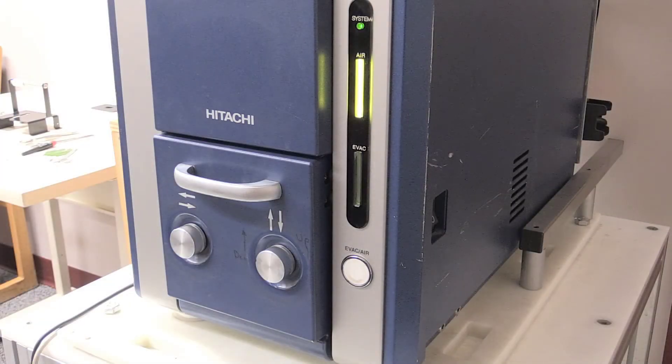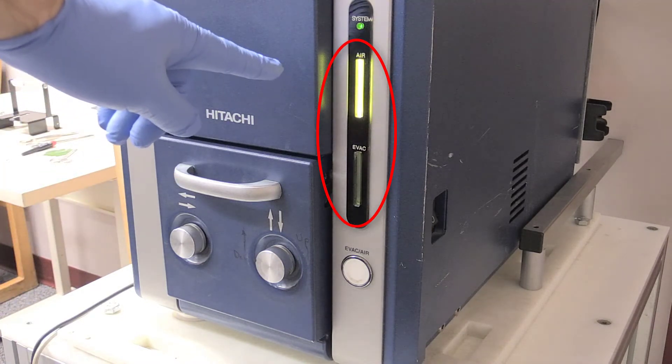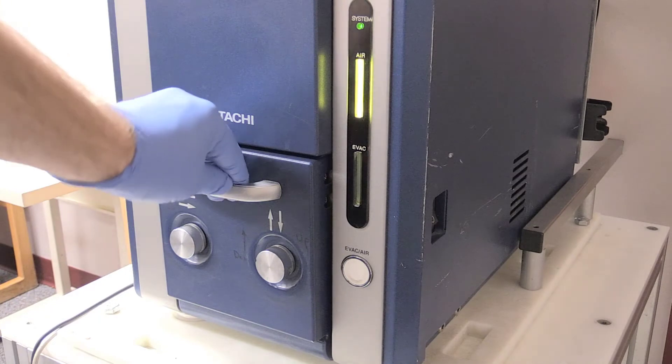If the EVAC LED on the front of the machine is solid yellow in color, pull gently on the specimen stage handle to open the unit.